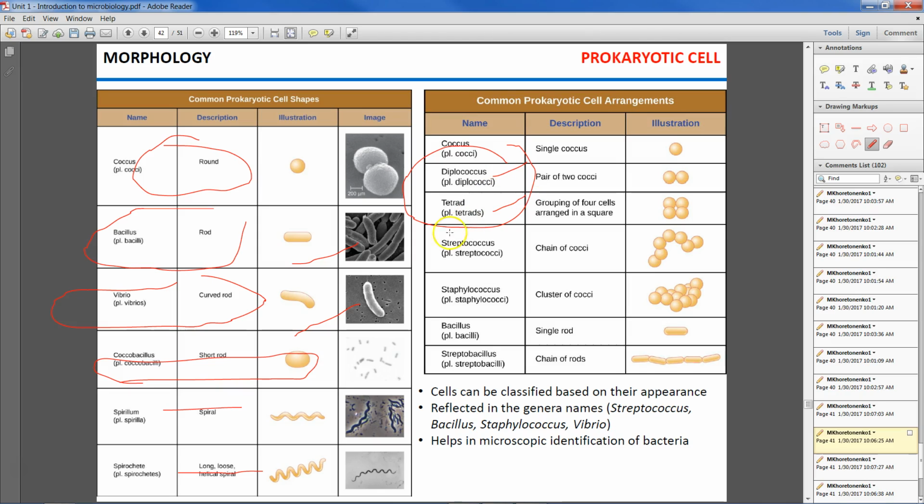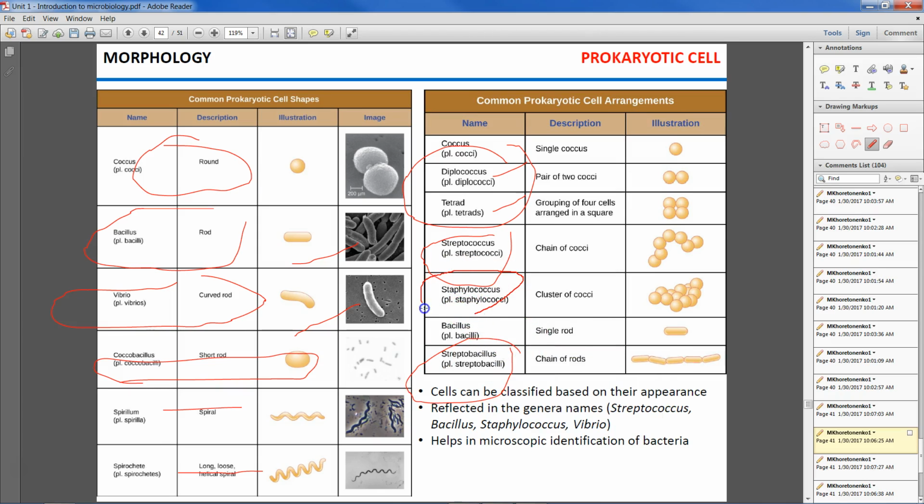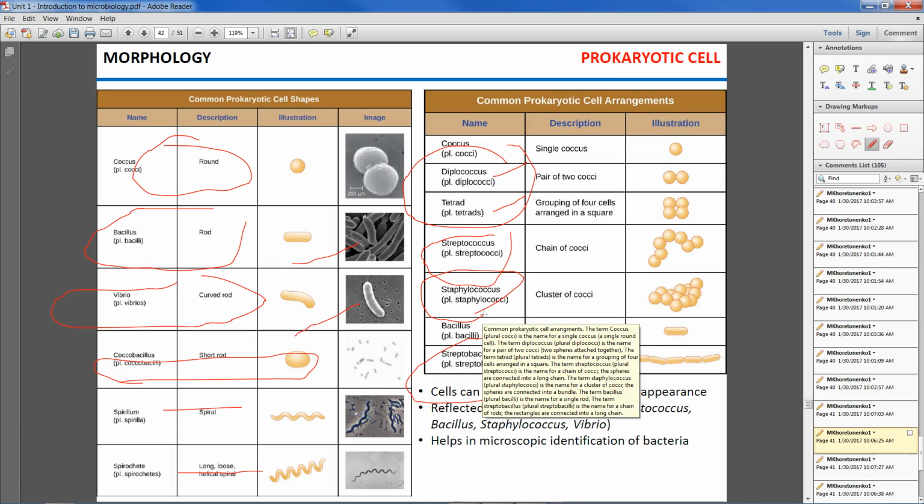We didn't look at the Streptococcus yet, which is organized in chains. Streptobacillus is organized in chains as well. But those of you who looked at the white colony, the colony of Staphylococcus epidermidis, may have noticed that it forms vast agglomerates, vast clusters of cells, Staphylococcus. So sometimes even names refer to the specific formations.